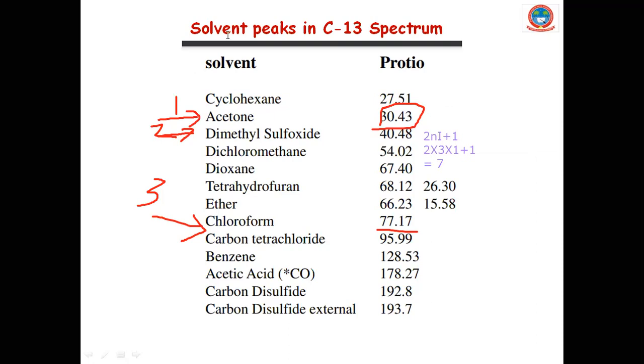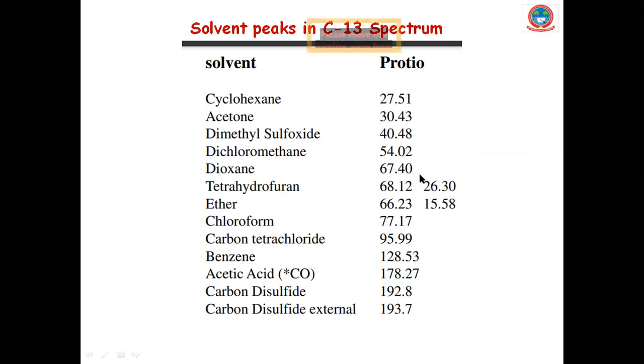So this is about the solvent effect and solvent peaks. We must know this to understand and to avoid confusion from the carbon-13 spectrum, about the peaks which are appearing in this range, and they will give splitting according to the solvent. So remember, one most important thing, let me show you one more slide.